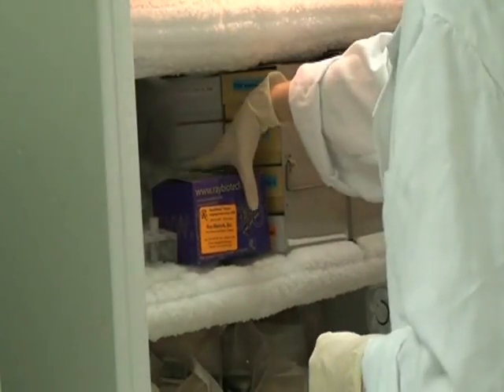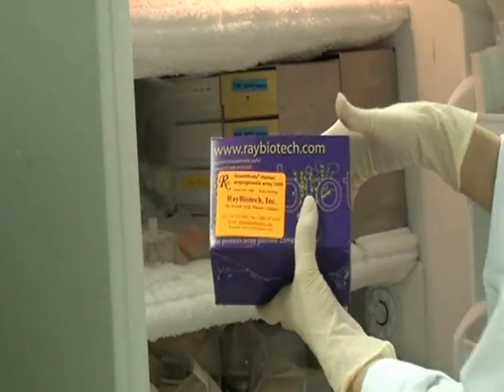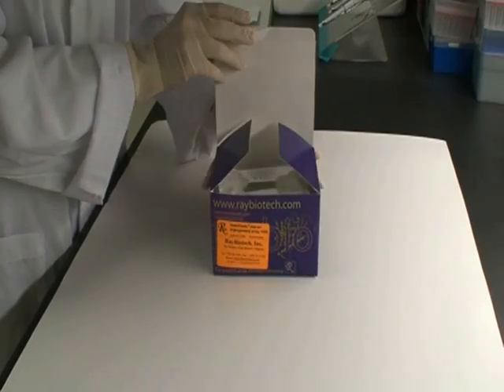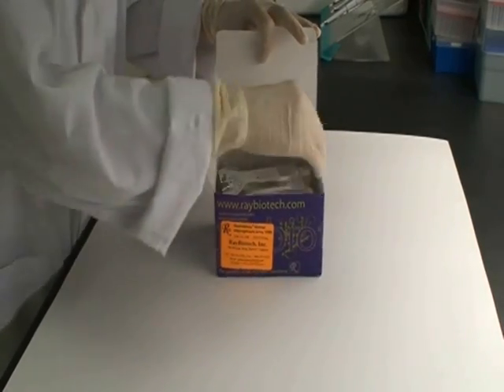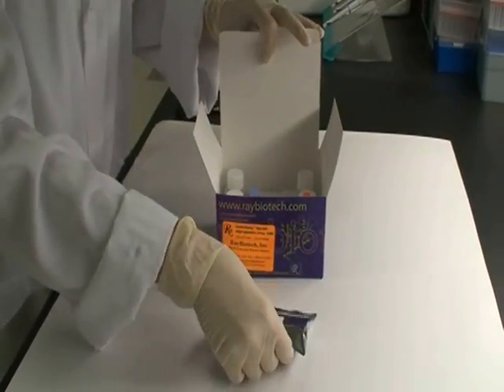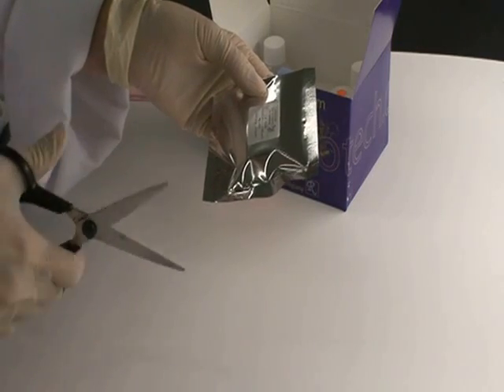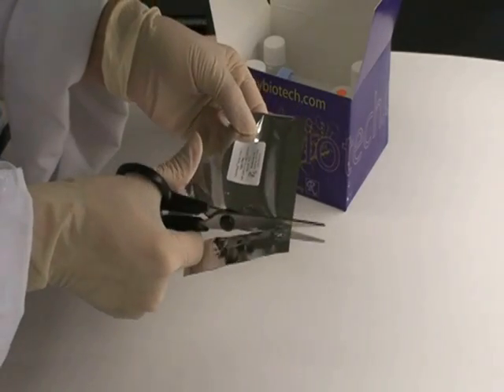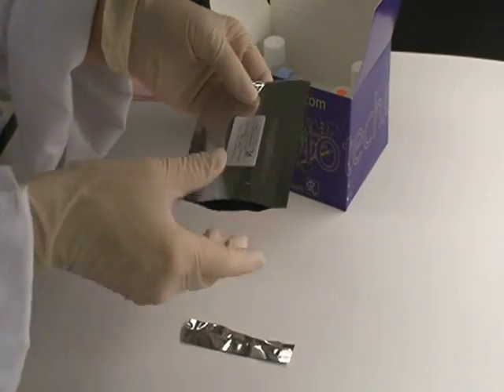Upon receipt, all components of the Quantibody Array Kit should be stored frozen. Before beginning your assay, let the slide equilibrate to room temperature for 20 to 30 minutes inside the sealed plastic bag. Then remove the slide from the plastic bag, peel off the adhesive cover film, and let it air dry for 1 to 2 hours.